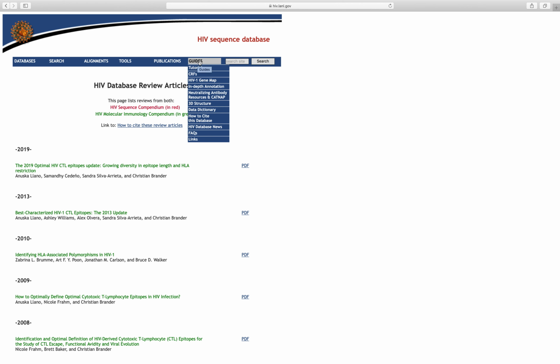Here we have guides in our last little tab here, and these are really, really useful to understand a lot of the resources that are embedded in this very important collection of resources. So I would encourage everybody that on your own time you actually go through these guides as well. This may actually be a pretty good starting point, which is kind of ironic because we're ending with it today. But I would encourage everybody to kind of go through here.